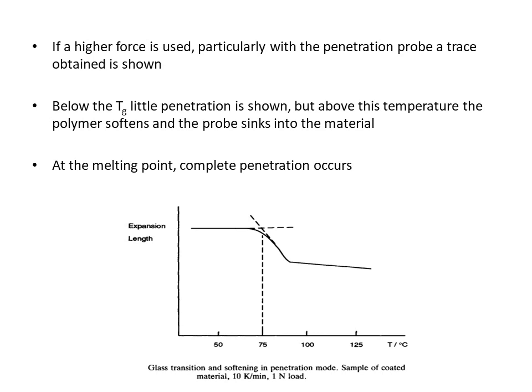While if a higher force is used, particularly with the penetration probe, then the trace obtained is shown over here. Below glass transition temperature, there is little penetration. We can see over here.